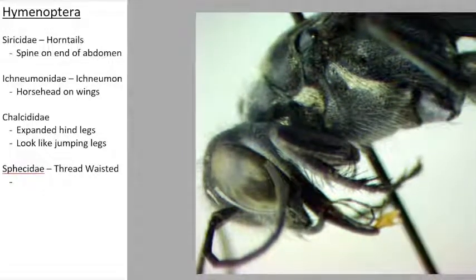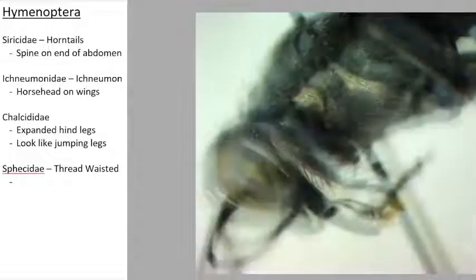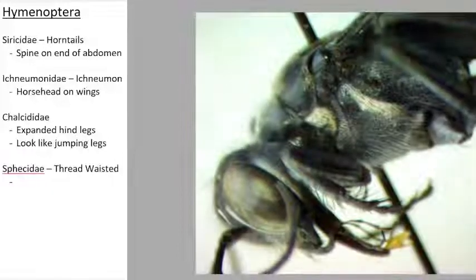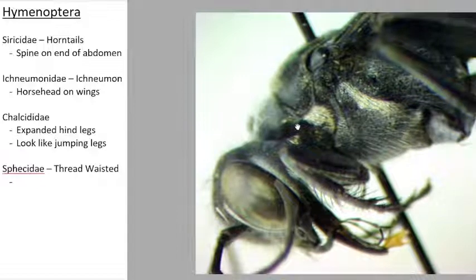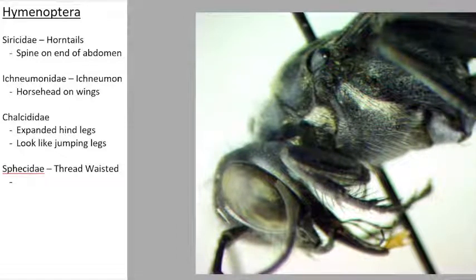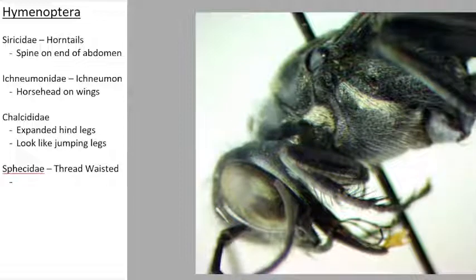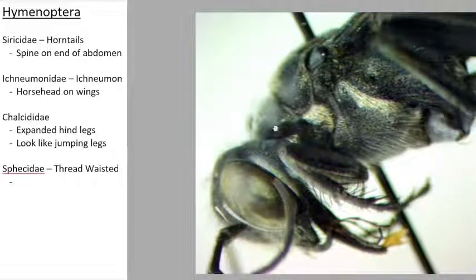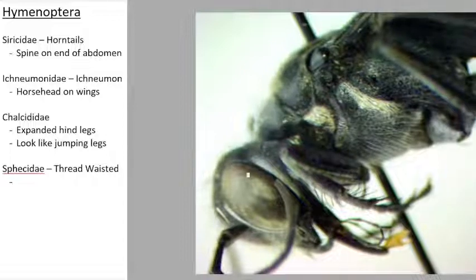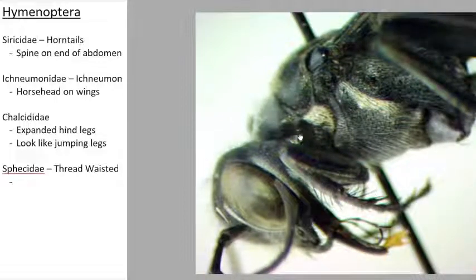All right, so right here we are looking at the side of the head and the thorax of our thread-waisted wasp. We're going to be looking at this lobed pronotum. So let's give you a couple words so that you guys can see this. We've got a head here. This first segment of the thorax on the top is called the pronotum.